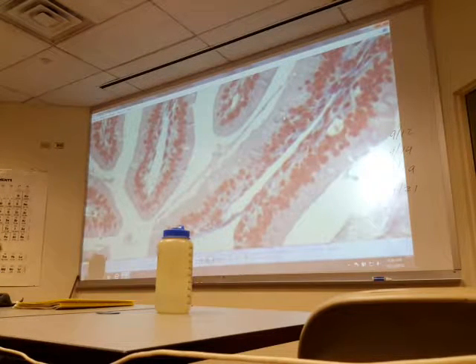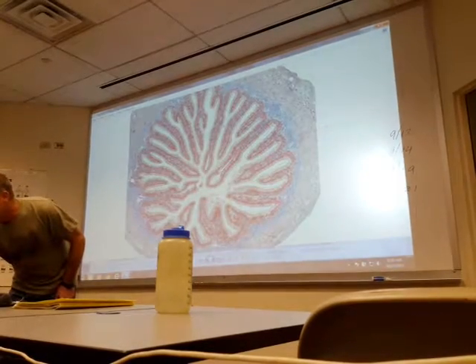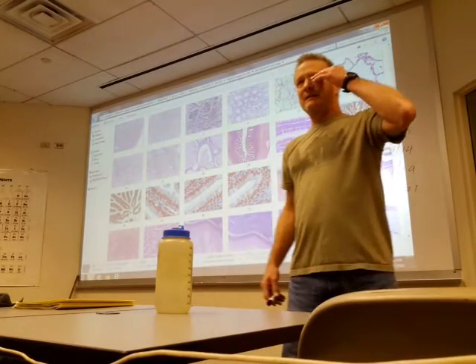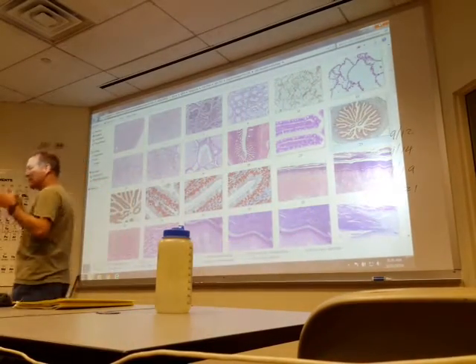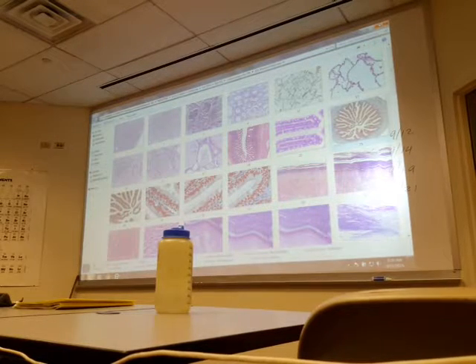The other thing I want you to keep in mind is that most of what we know and most of what we see, we know and see because people have studied the tissue with much more sophisticated microscopes. Think about our microscopes. Think about your basic lab 1 in biology. This is a microscope, the arm, the base. This is how you carry it. This is the rotating nose piece.